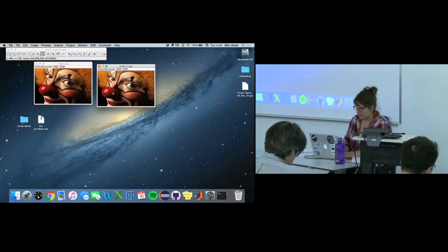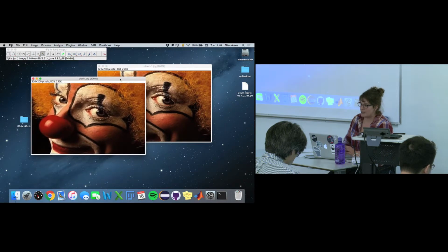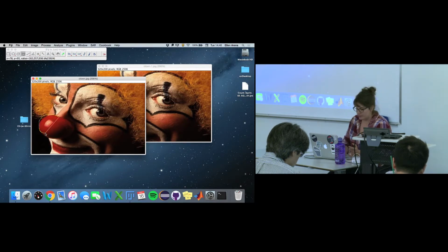So what I'm going to ask you guys to do is use this bean-shaped ROI tool that's freehand selection and draw as best you can to delineate his nose. Kind of draw a circle around his nose. When you're using this particular ROI, you just have to click and hold, because as soon as you let go, it'll close that shape. I'm really horrible at this, so just try and circle his nose as best you can.